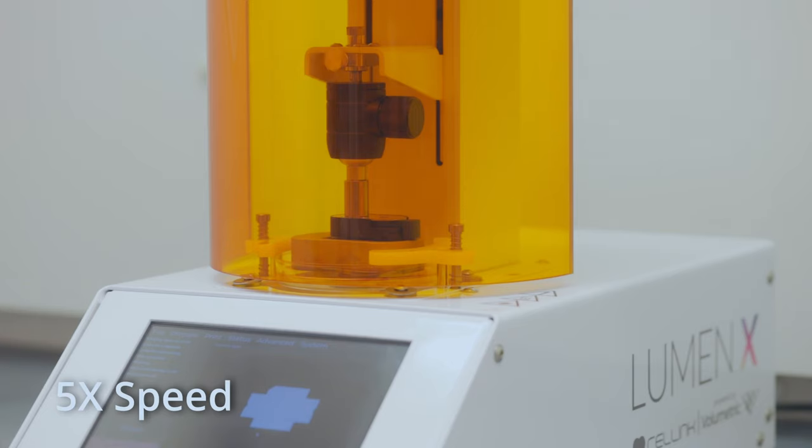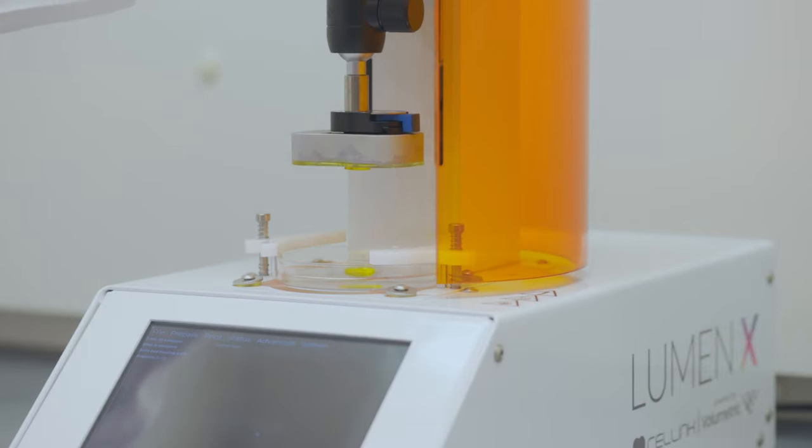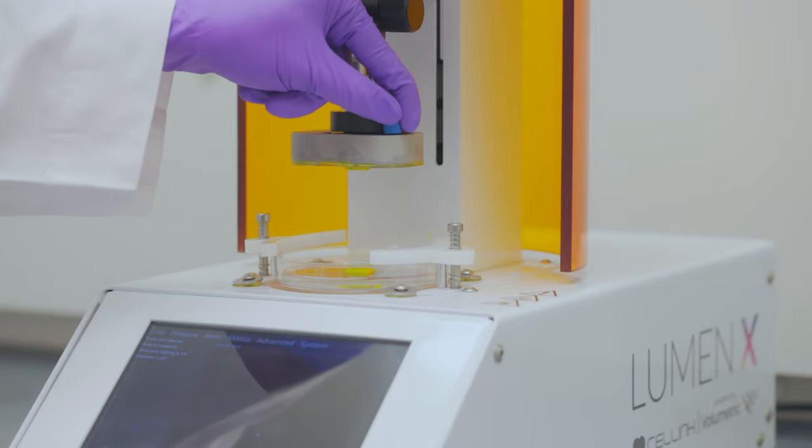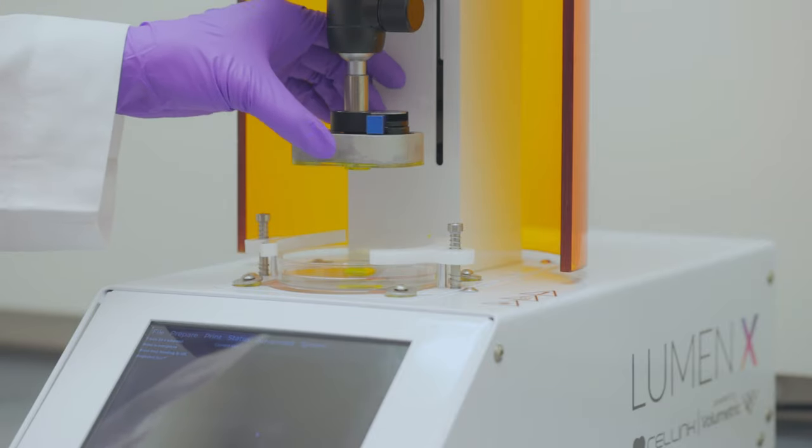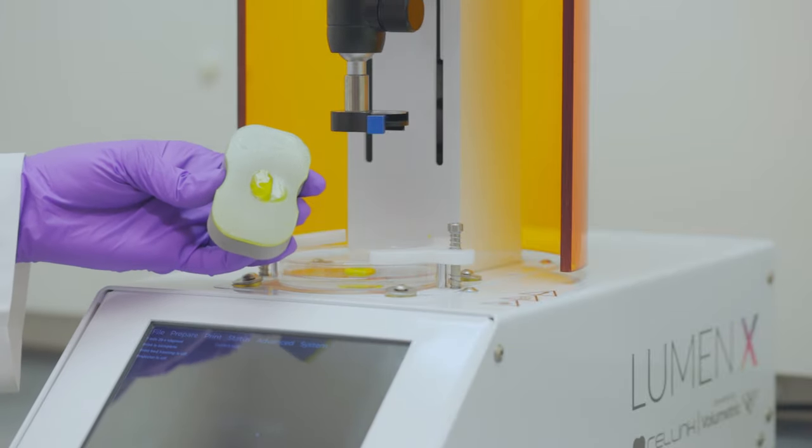After the print is completed, turn the light shield. To remove the build platform, turn the knob clockwise and slide the build platform. And we have the printed object on the build platform.